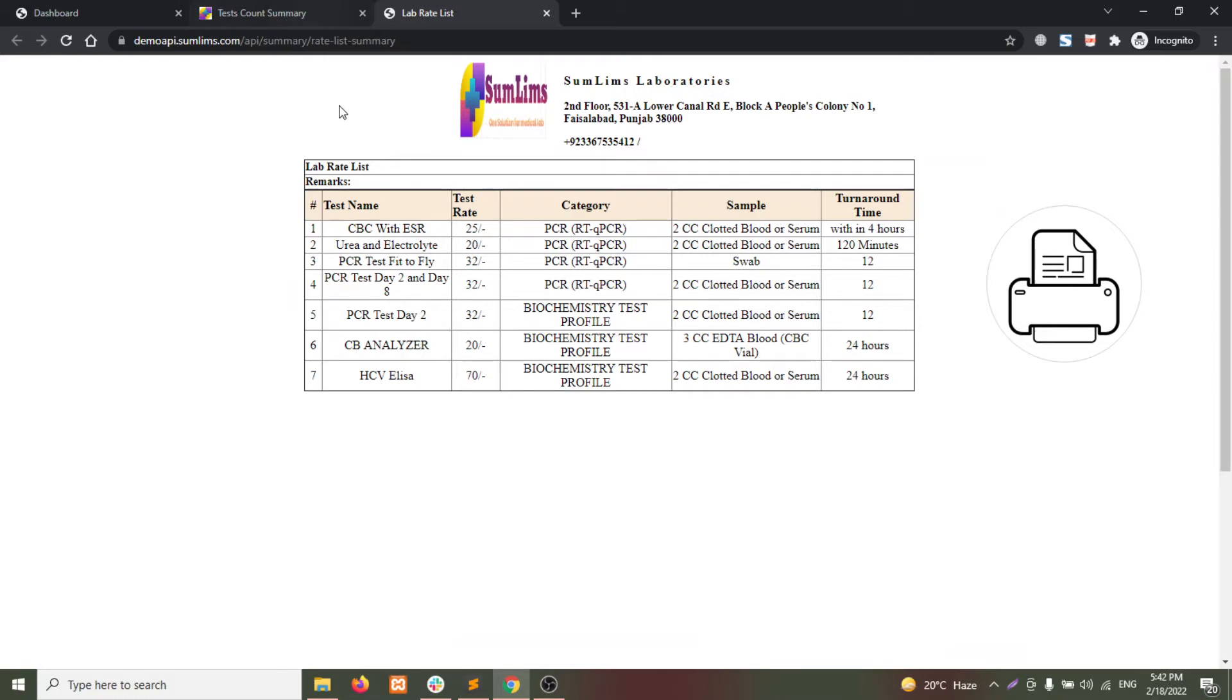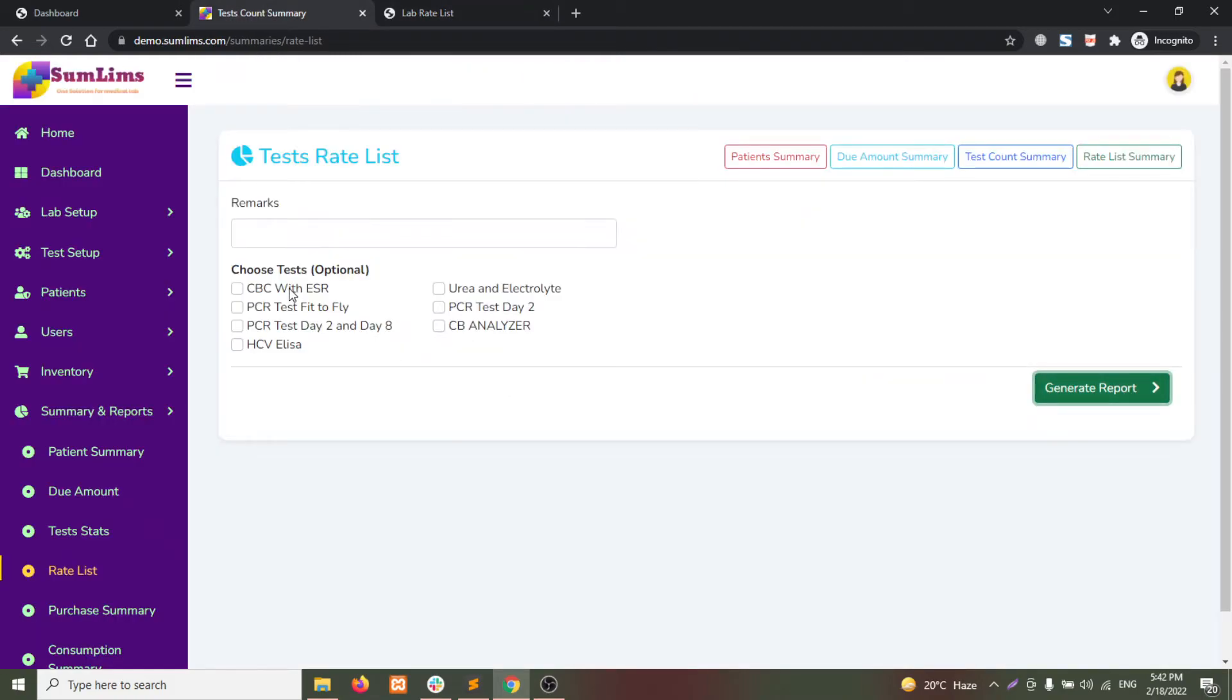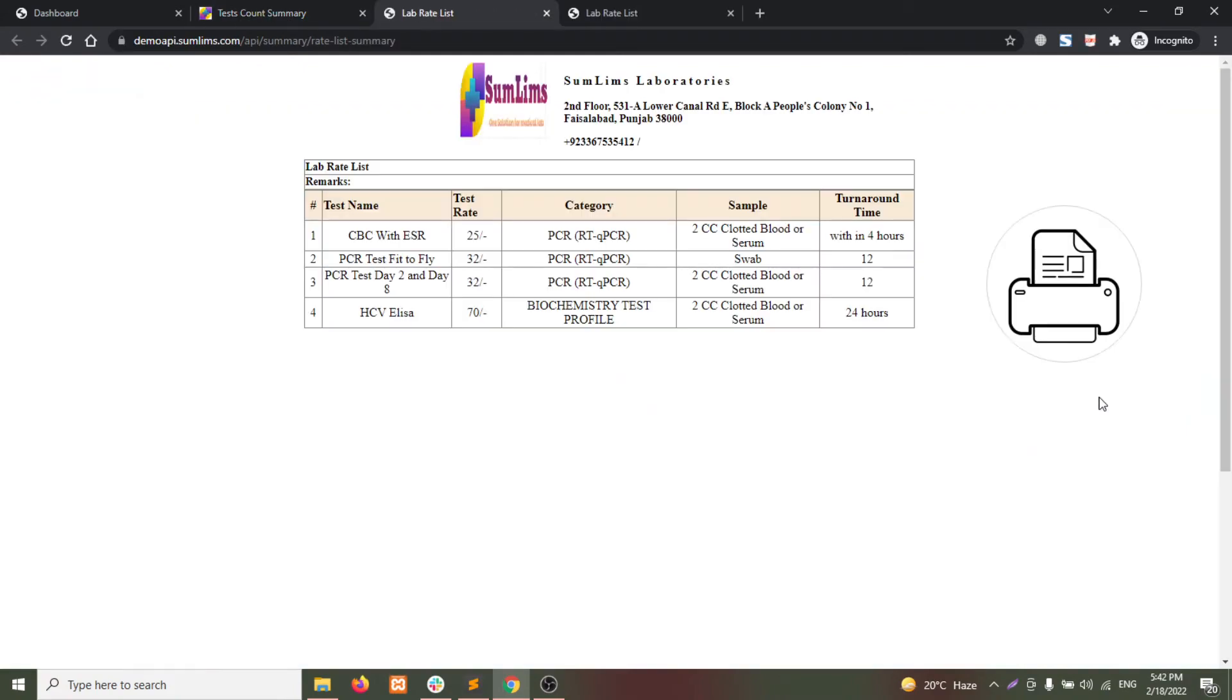If you want to limit the tests, you can choose from the available list. Click on generate report again and you will see the limited tests.